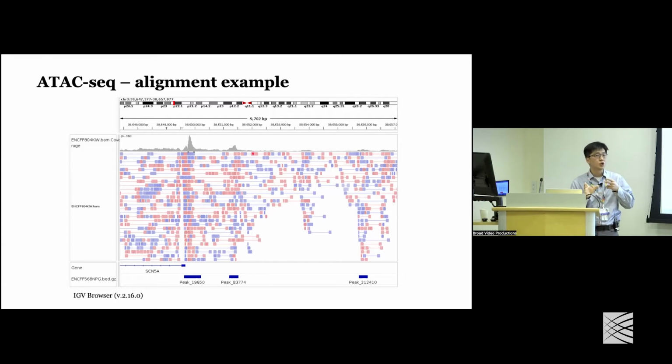And also, for the ATAC-Seq analysis, MACS2 is actually equipped with the estimation of the read shift mapping to the negative strand and then plus strand that are specific to the ChIP-seq. That doesn't apply to the ATAC-Seq. So you really have to use a specific set of parameters in order to use MACS for the ATAC-Seq.